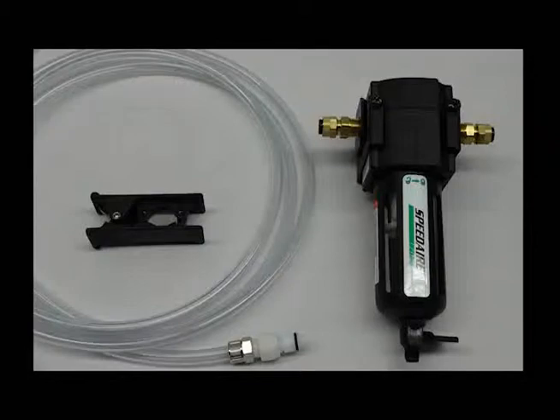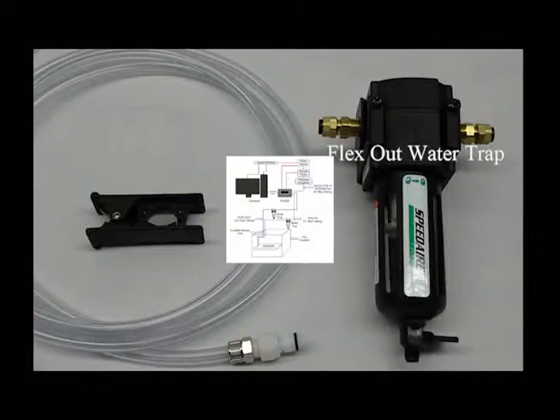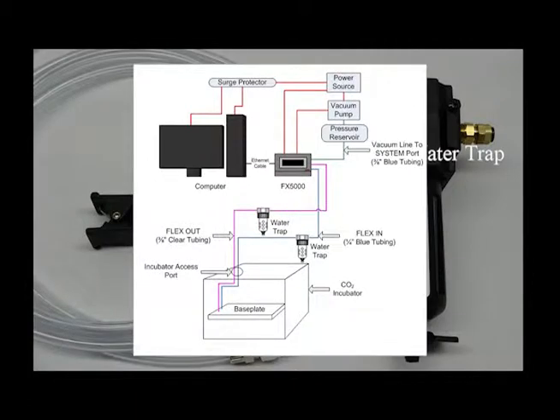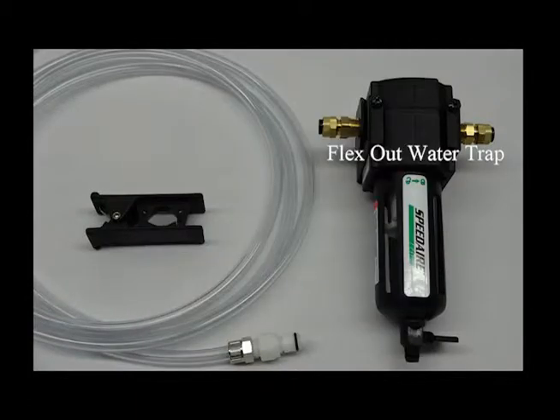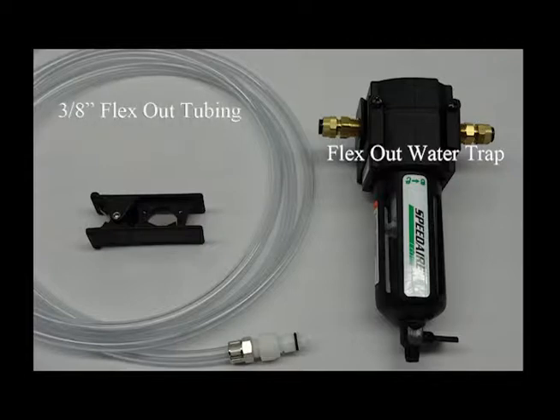This video shows how to connect the provided water trap in line with your flex out tubing. To do so, you will need your flex out water trap, flex out tubing, and a tubing cutter which is provided.